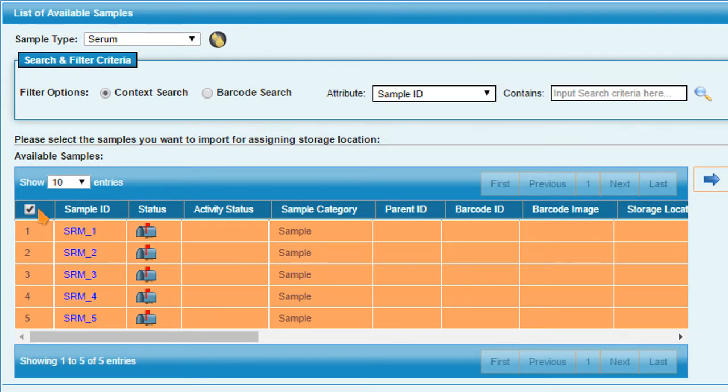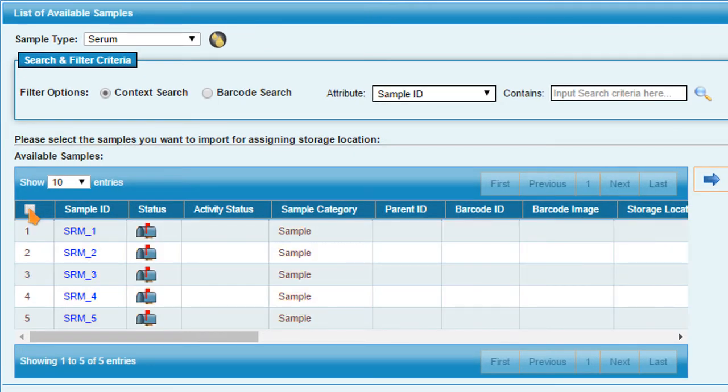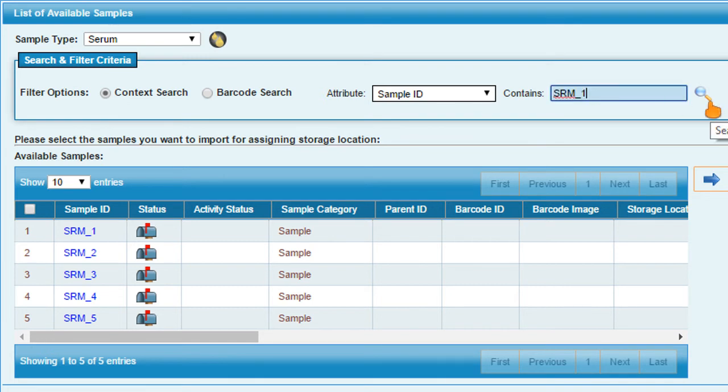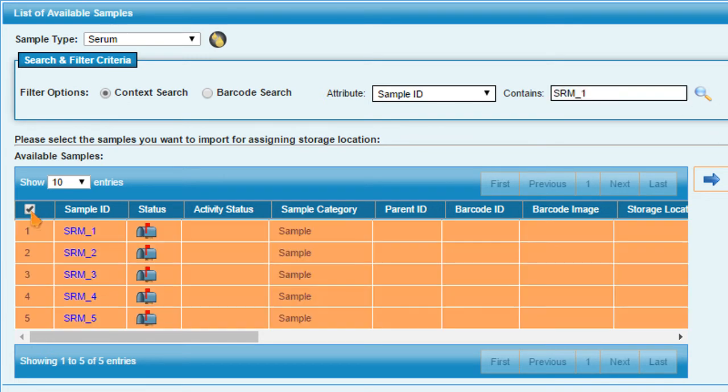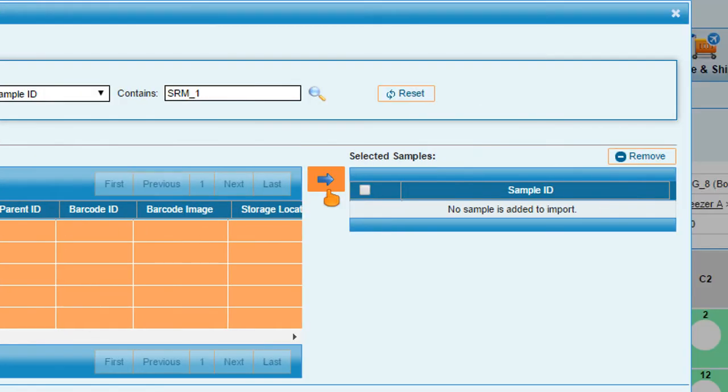select the sample batch. Select a filter option of your choice. Select the sample and press Import.